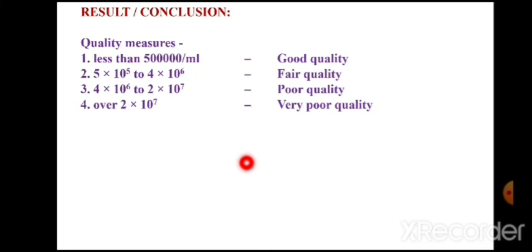So whatever the count is, according to that you have to draw the conclusion, that the given milk sample shows a count of, say for example, 5 lakhs per ml, so the quality of milk is good.